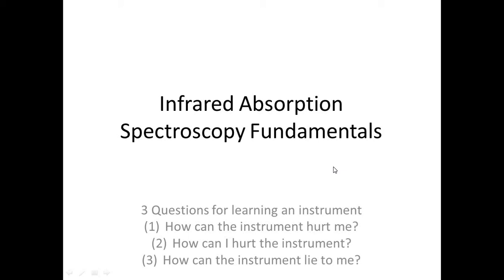works. Note that I'm not going to go over what buttons to push or how the software works for the most part. This is not a training video of how to actually operate the instrument. Knowing what sort of buttons to push will only teach you how to operate that particular instrument, and it doesn't teach you how to troubleshoot it. Whereas learning the fundamental basis of the measurement is something that you can carry over to any make or model of instrument. So with that, let's get started.